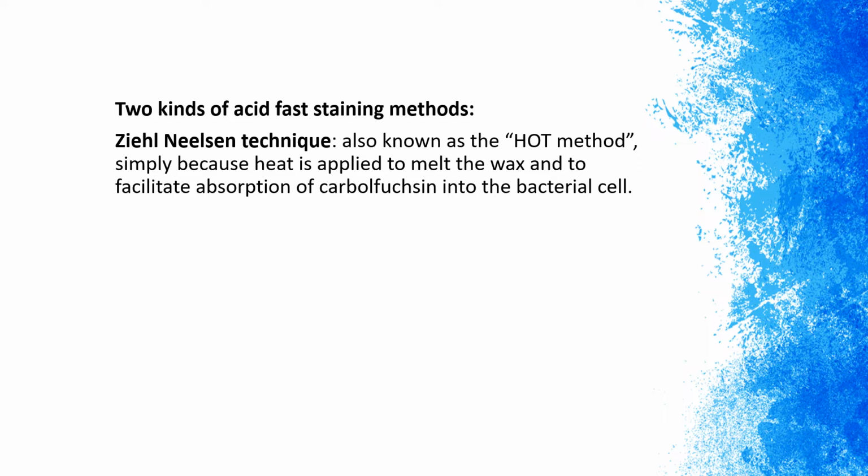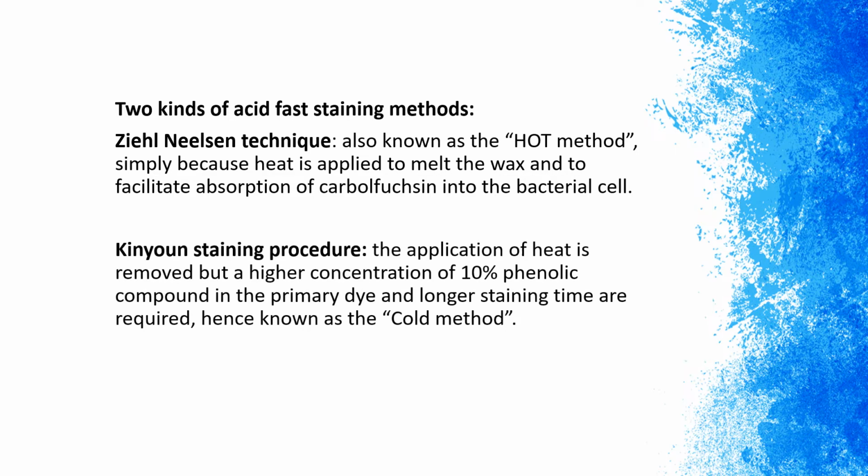bacilli. On the other hand, we have the Kinyoun staining procedure, wherein the application of heat is removed, but a higher concentration of 10% phenolic compound in the primary dye and longer staining time are required, hence known as the cold method. This method has higher sensitivity, specificity, and efficiency than the former.